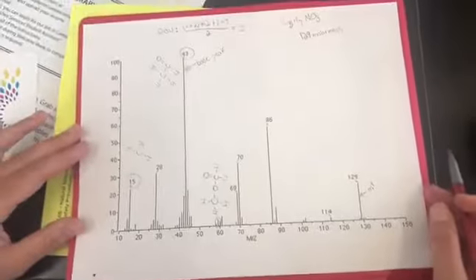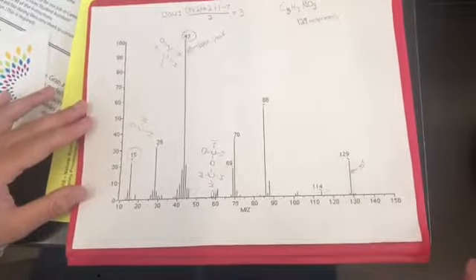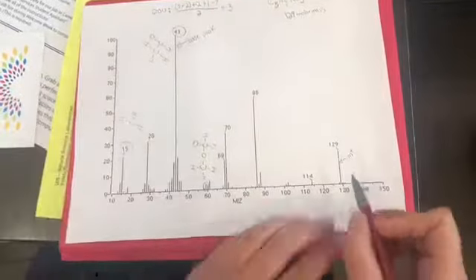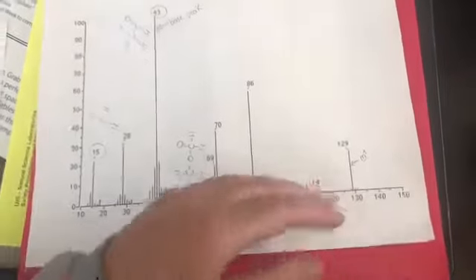Hello, I am Savannah Brandon, and I will be looking at mass spectroscopy and analyzing 4 different graphs to show how you can determine from the information provided by these graphs what your molecule actually looks like and its structure. So this is my mass spec graph for my molecule C5H7NO3. The first thing that we find is the molar mass is 129. And if you look here at the M plus peak, it tells you what the molar mass is.